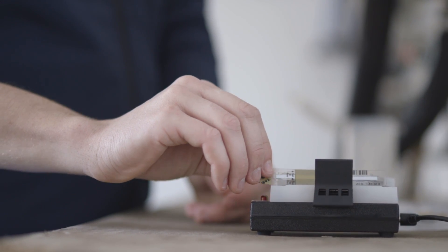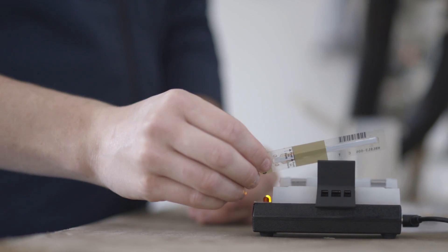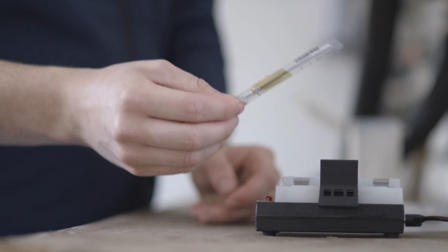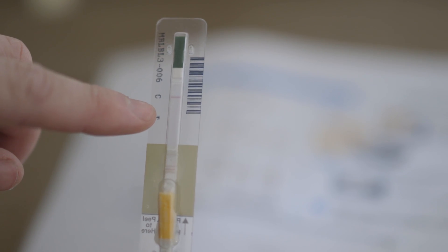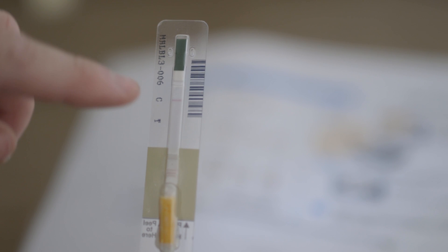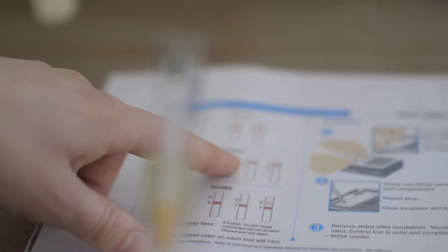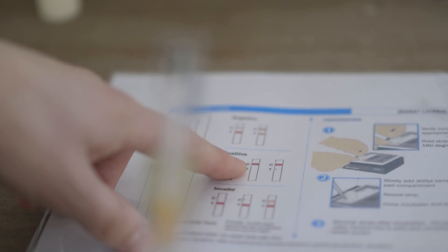On our positive example, it's the opposite. Our control line is much darker than our test line.